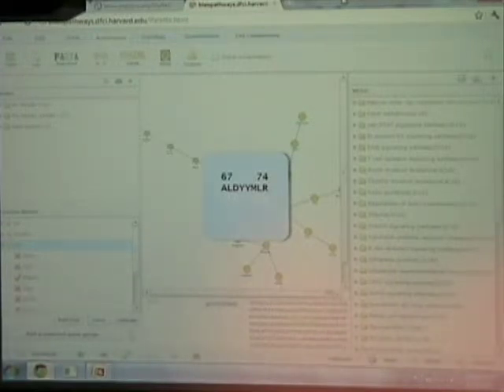In the microarray world, this would be the equivalent of letting them see the image and how you call the spots and stuff. Most won't care, but especially for high-level journals, there's a need right now for a way to allow reviewers to nitpick. So this is a good tool for that.